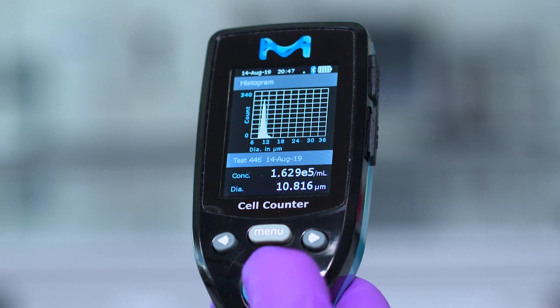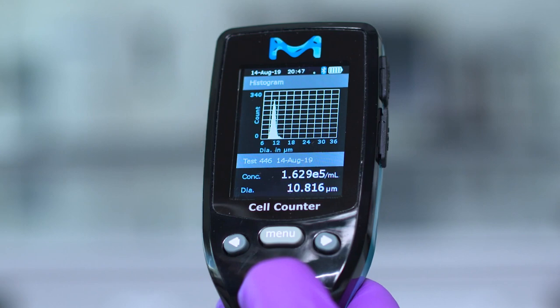Scroll to desired histogram using left and right arrows. Press OK for edit analysis.